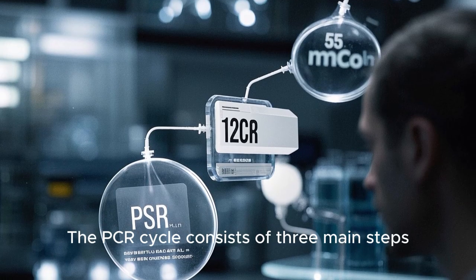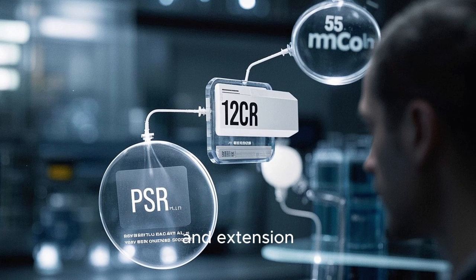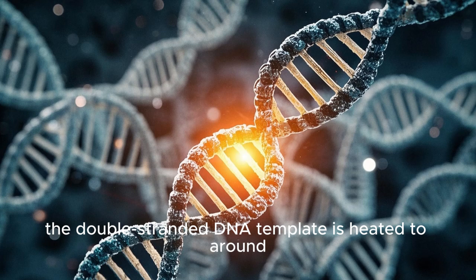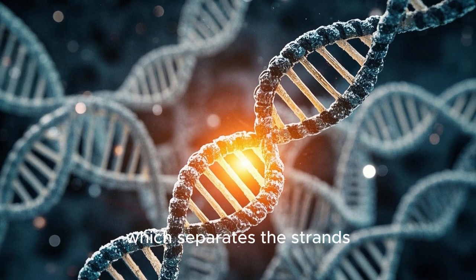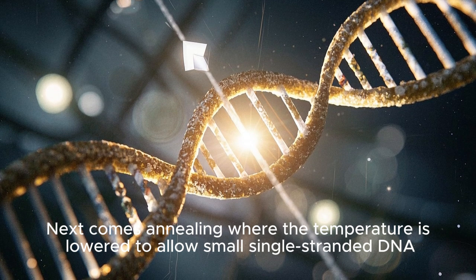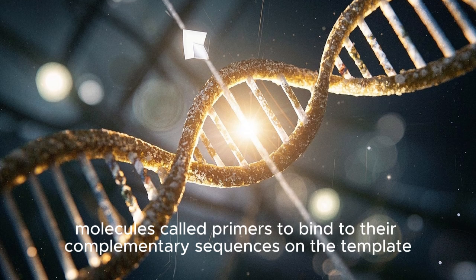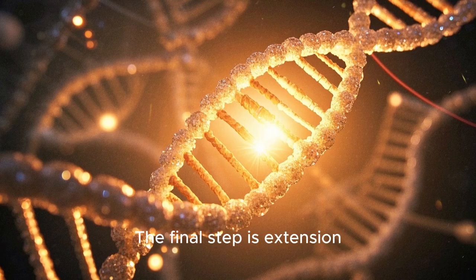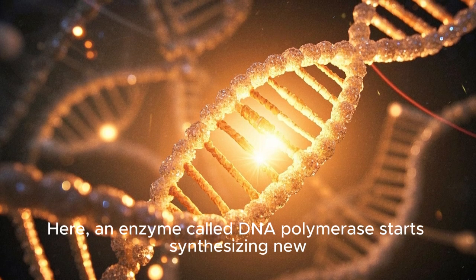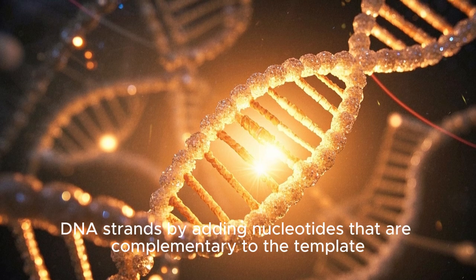works. The PCR cycle consists of three main steps: denaturation, annealing, and extension. During denaturation, the double-stranded DNA template is heated to around 95 degrees Celsius, which separates the strands. Next comes annealing, where the temperature is lowered to allow small, single-stranded DNA molecules called primers to bind to their complementary sequences on the template. The final step is extension. Here, an enzyme called DNA polymerase starts synthesizing new DNA strands by adding nucleotides that are complementary to the template.